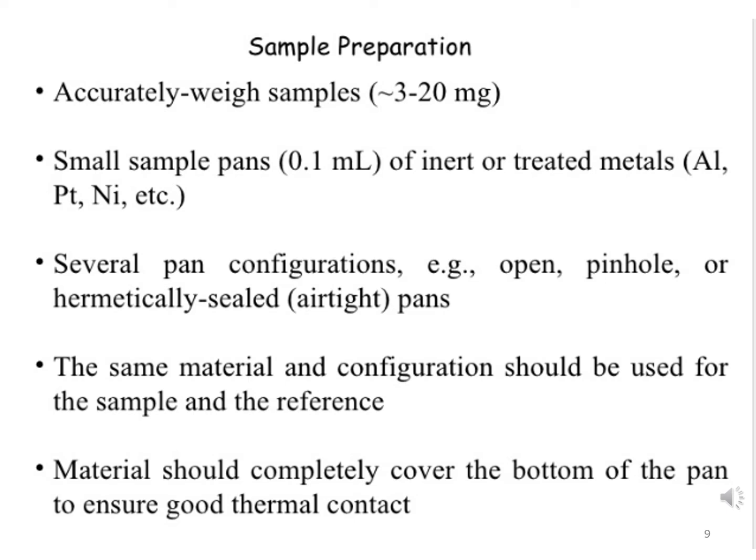The sample that we are analyzing should completely cover the bottom of the pan to ensure good thermal contact. So if we put our sample in the pan, it should completely cover the bottom of that sample holder, so that the analyte can get good thermal contact with the pan.